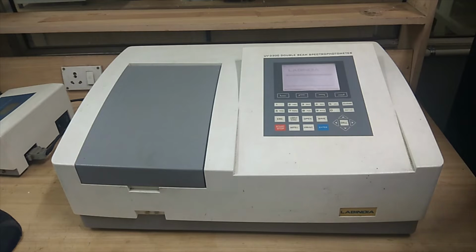This method is based on the principle that the protein binds to the dye, which is Coomassie brilliant blue, in acidic solution, and it forms a complex whose lambda max, or the maximum wavelength, is around 595. Whereas the free dye has a maximum wavelength of 465 nanometer. The intensity of absorption of the protein-dye complex is proportional to the concentration of protein.